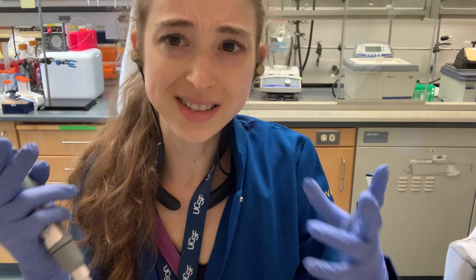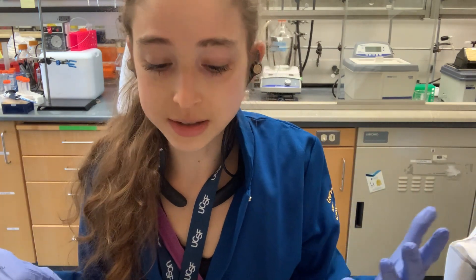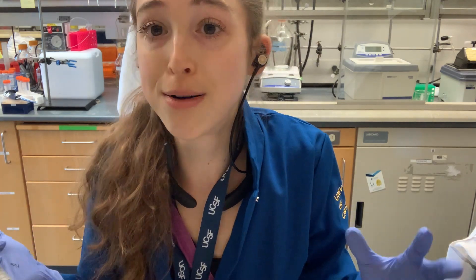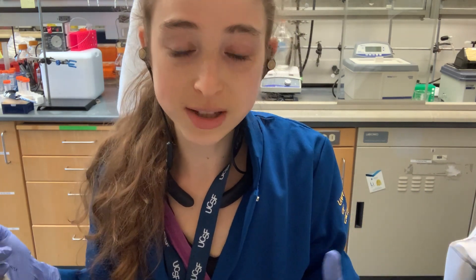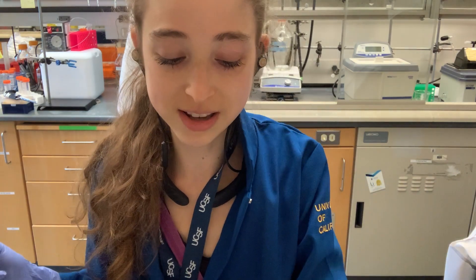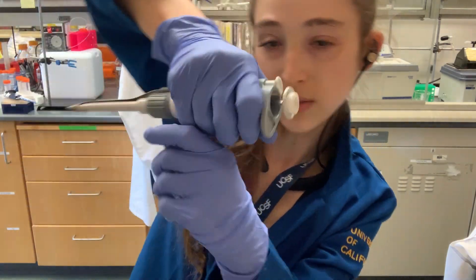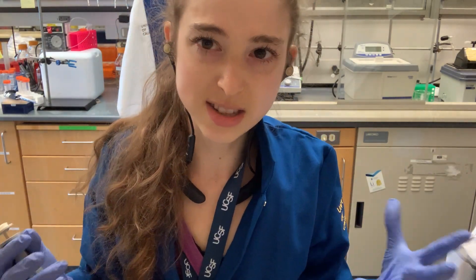A couple other things that kind of seem like 'duh' but come into play all the time: open your tubes before you go and grab your pipette tip. I have to remind myself of this constantly. This can be especially problematic with screw caps where you can't just unclip them with one hand — you definitely want to unscrew those caps before you take your pipette tip, so that you're not moving your clean pipette tip all around and jamming it into things when you're trying to keep tips nice and sterile.